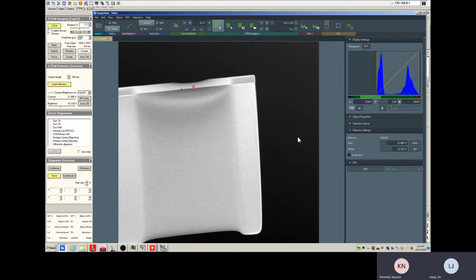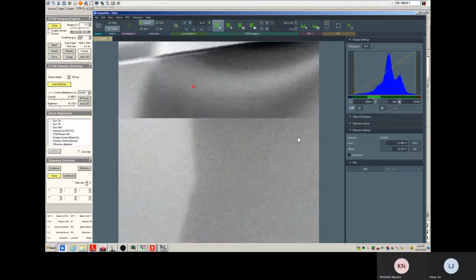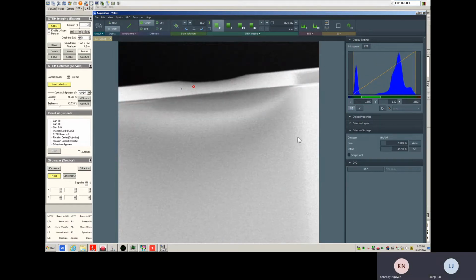Okay. So I want to take one image in here, on the sample without any contouring. One within this, because here you see some deformation. You should see some strain there. So let me stop.